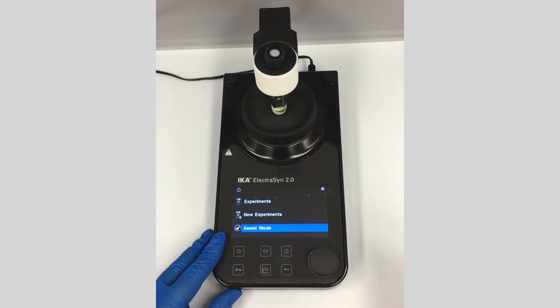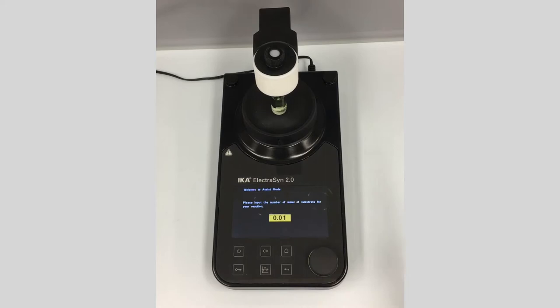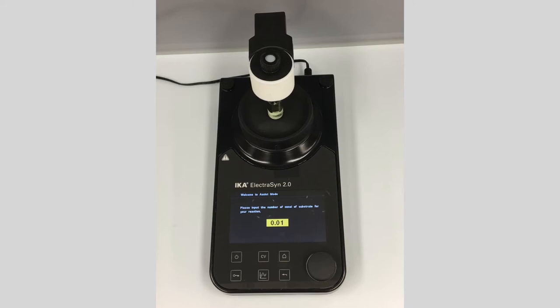From the home screen, we go to assist mode and click here. This is going to give me guidelines for how to run this reaction based on the number of millimoles of starting material and the number of equivalents of electrons I want to use for reductions or oxidations.